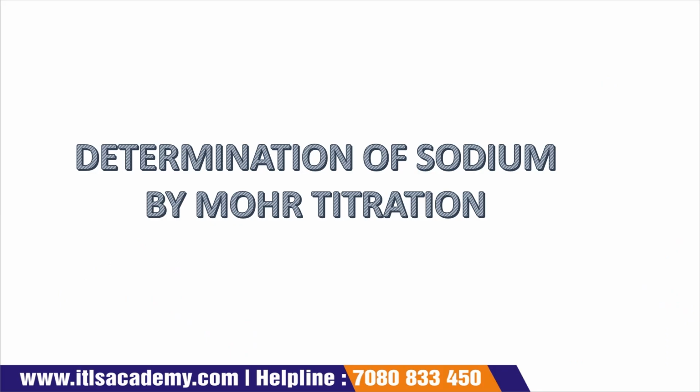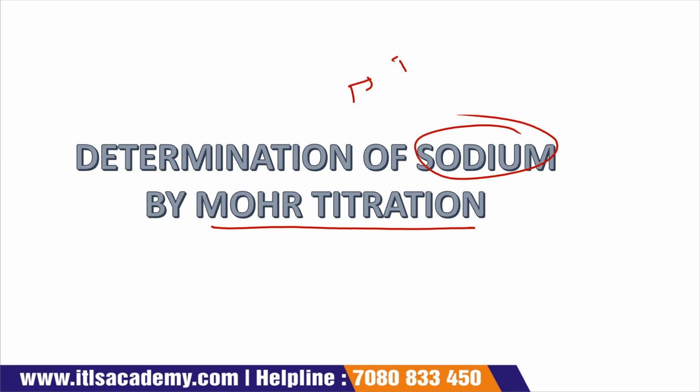Today we are going to discuss the determination of sodium by a Mohr titration. In the previous lecture we already discussed the determination of sodium by an ion selective electrode, and in the same lecture I told you the importance of sodium and why we have to determine it. If you have any query related to this, go and watch the video on determination of sodium by an ion selective electrode, where the introduction part is also covered.